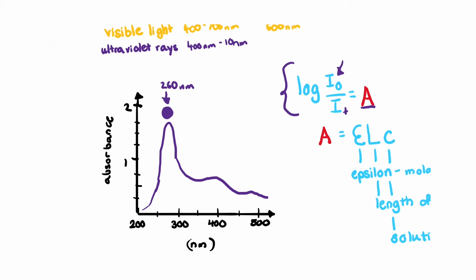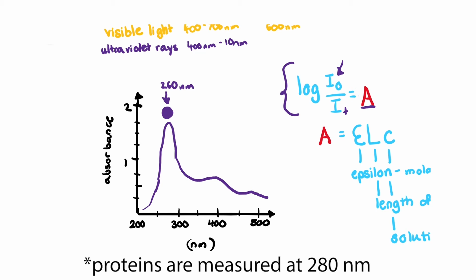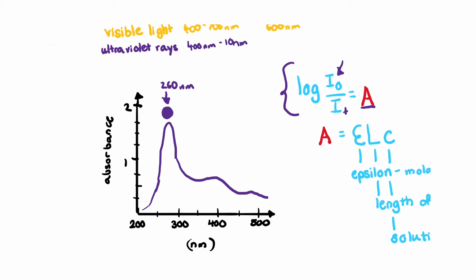Well, this is used in multiple different ways. First, you can see again the concentration of proteins, or how many proteins are in your sample, just by seeing the absorbance, because proteins absorb that wavelength of light. And so when there's more proteins, there would be more absorbance and less intensity emitted. And when there's less proteins, you would have more intensity emitted because less proteins are absorbing that light. And the same applies to nucleic acids and to bacterial cells.